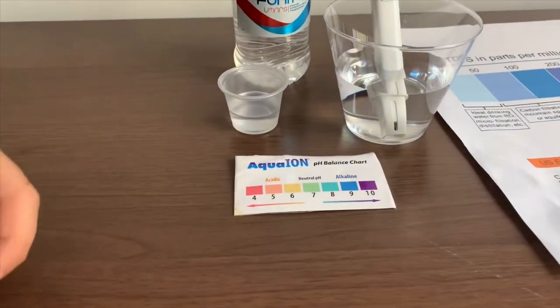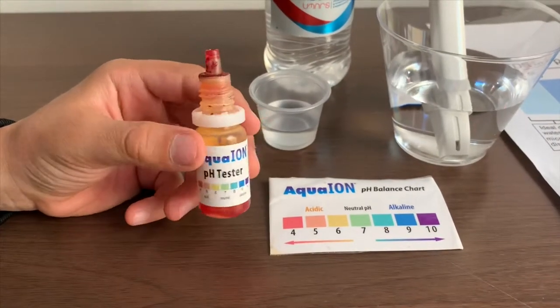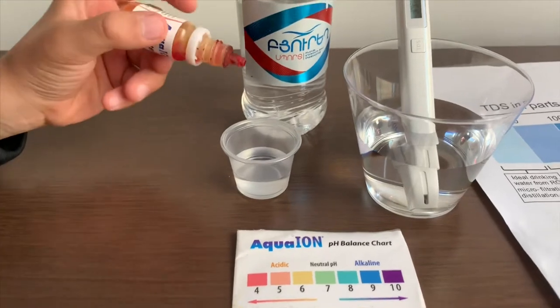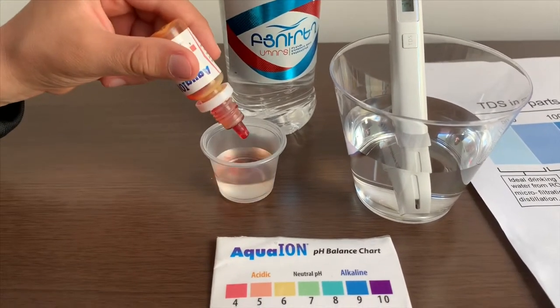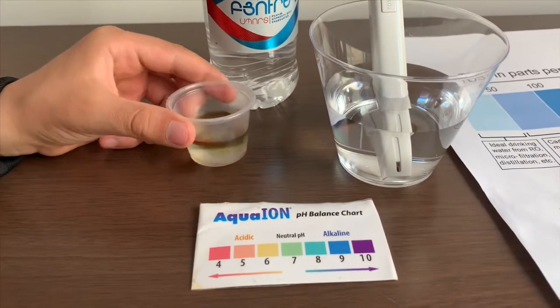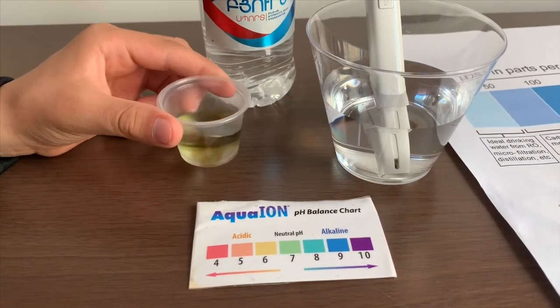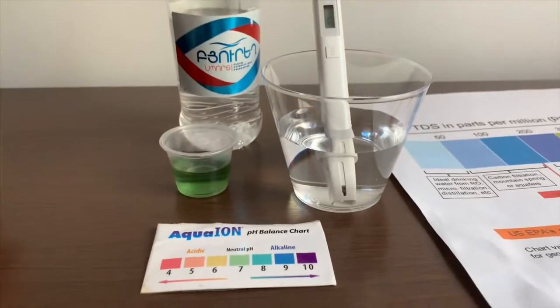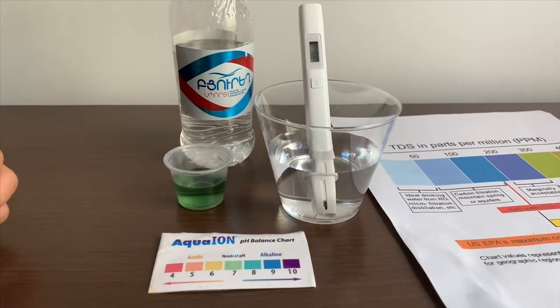Now let's test the pH level. If you want to buy this pH tester, check the link down below. We'll only do two drops. Let's stir it a little for a better result. I give this an 8 — this is alkaline water.